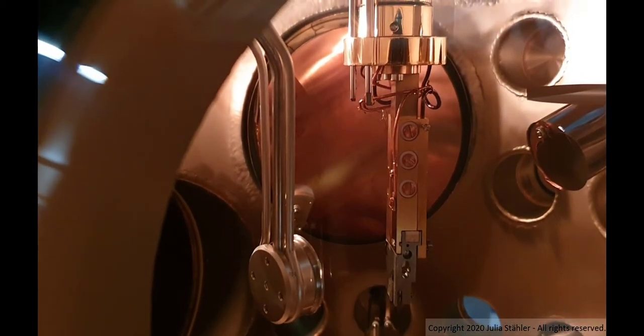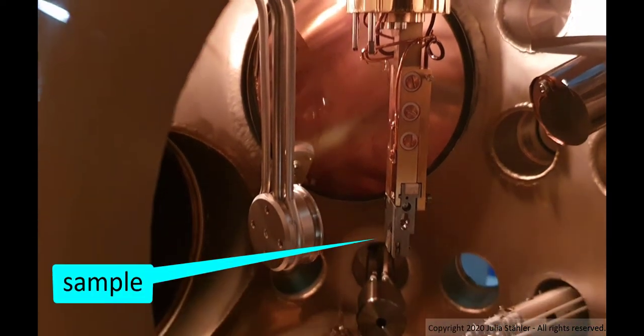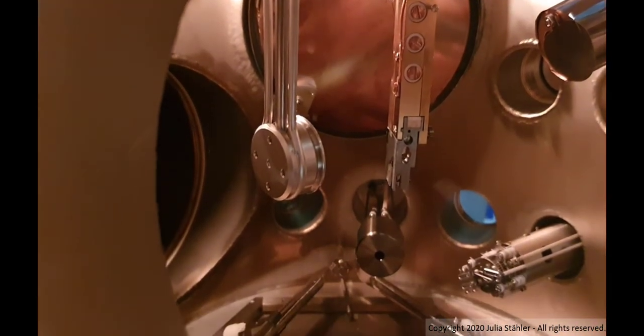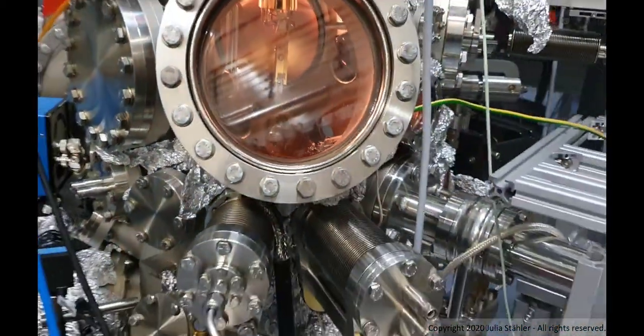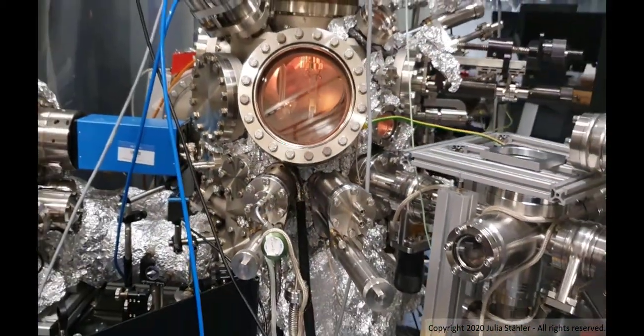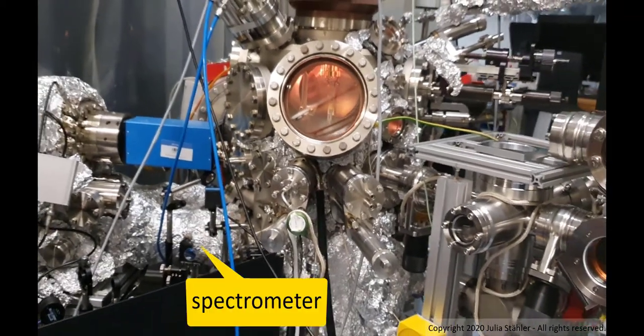What's important today is that our sample is inside the vacuum. And this sample can be moved down through this gate valve into the lower part of our vacuum chamber, facing the photoelectron spectrometer.